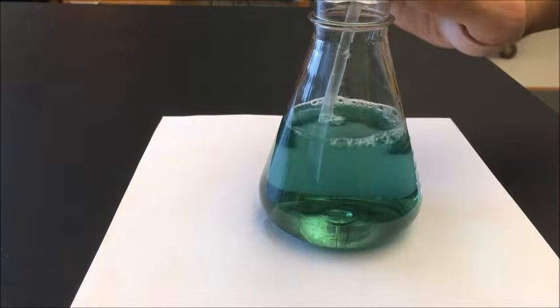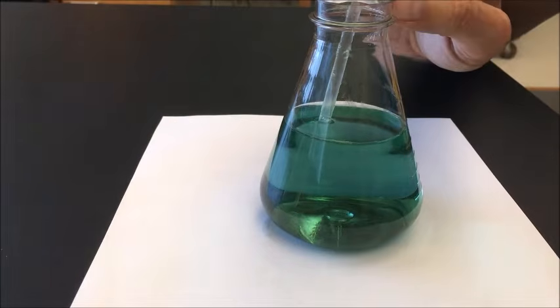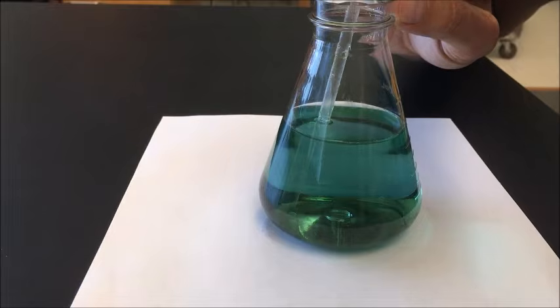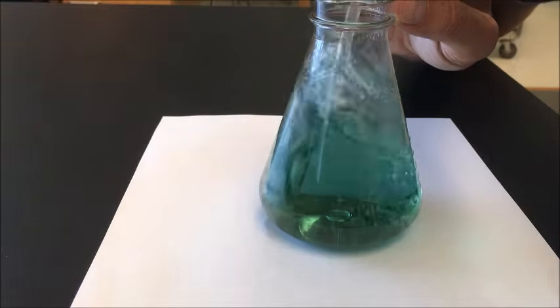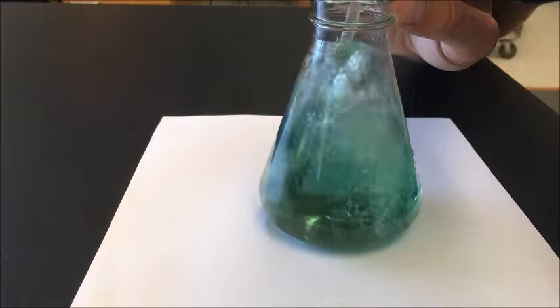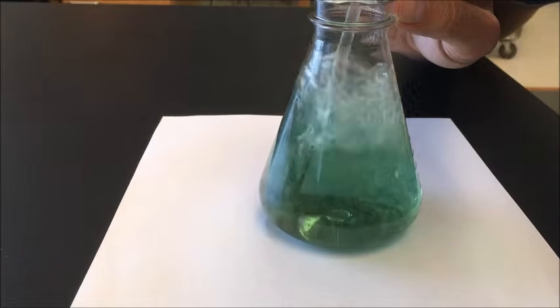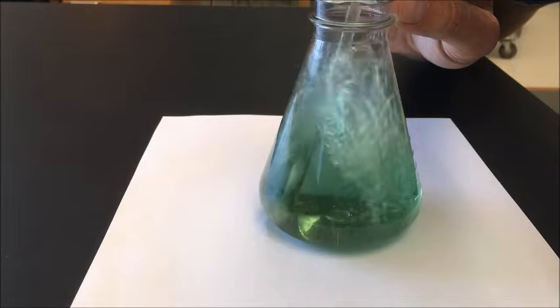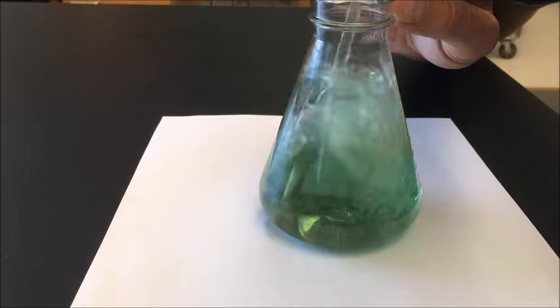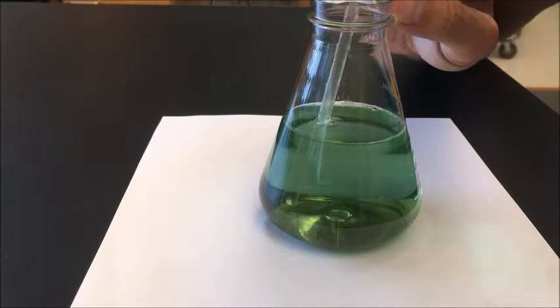So you can see after about 15-20 seconds, it's kind of turned to a green color. Let me keep going for a little bit. And let me give it one more good breath.